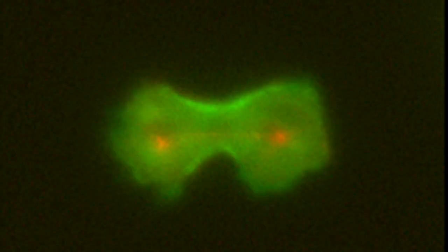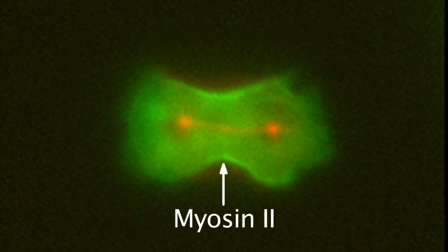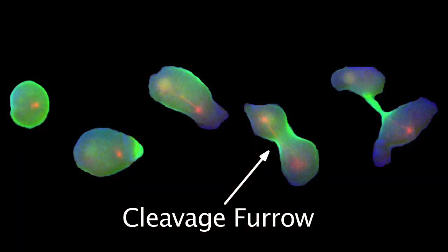Dictyostelium are single-celled amoebas that undergo cell division in a manner similar to human cells. The red structure is called the mitotic spindle and separates the genetic material into the two halves of the cell. The green signal is the protein myosin-2, which is found throughout the skin of the cell and concentrates in the cleavage furrow, where the cell's skin squeezes together until the cell divides in two.